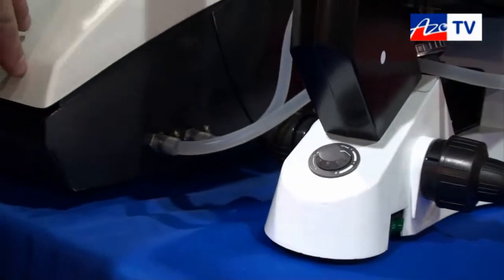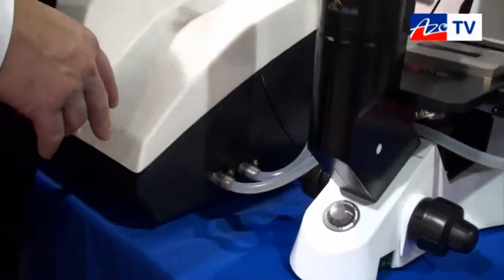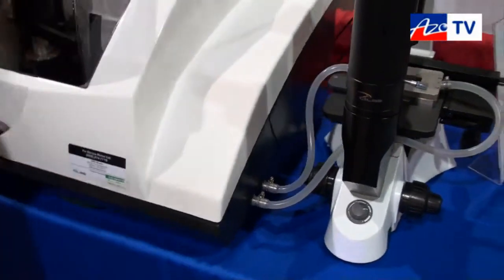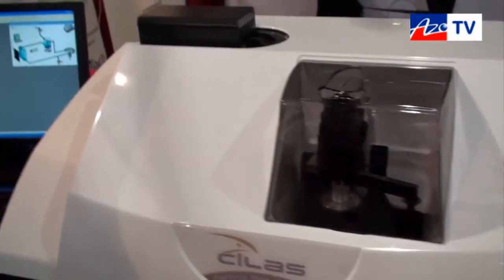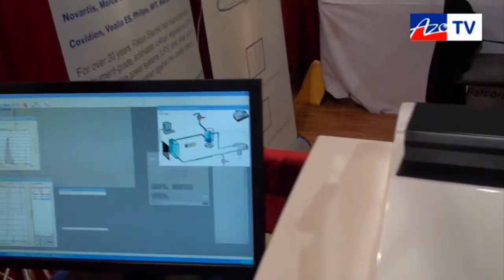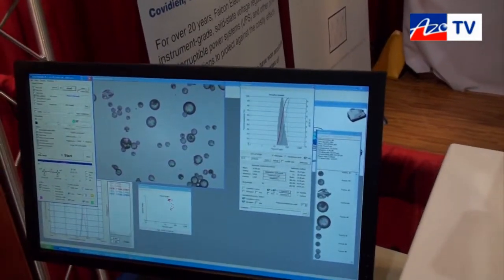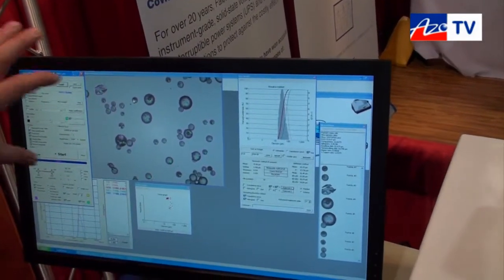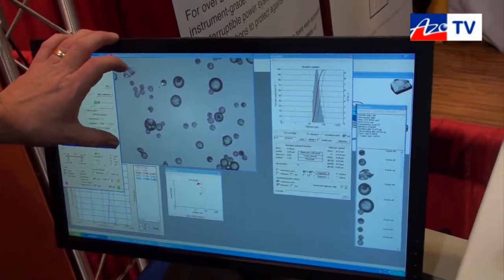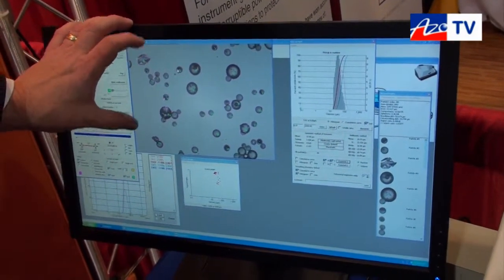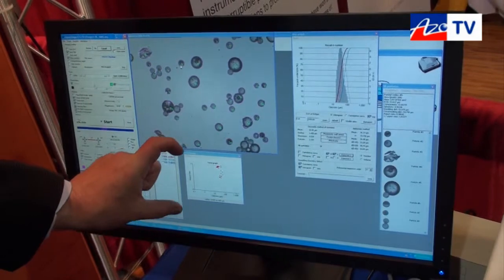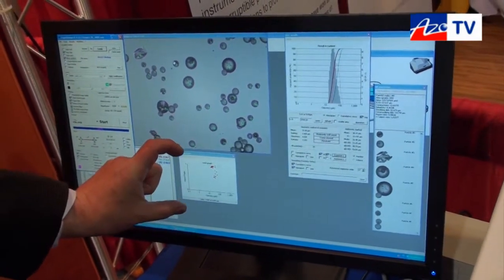What the software will show you is we will open up the shape software and you will see here we have a full featured shape analysis software. We have an image that is one of the images that we collected. We can trend on various different types of measurements or parameters, in this case we're trending on aspect ratio which is an indication of non-spherical particles.